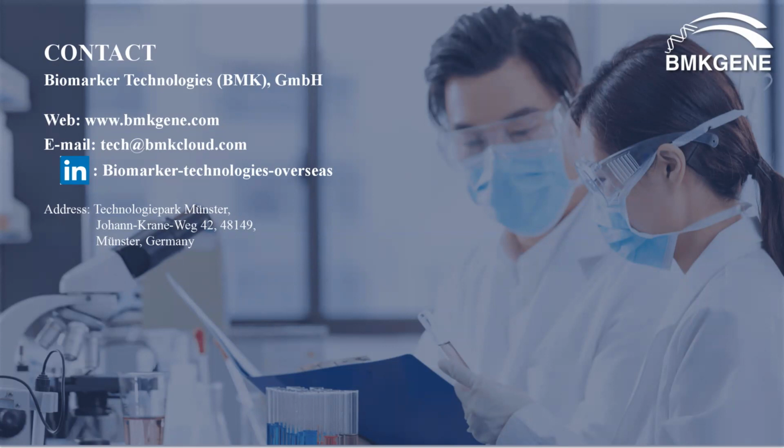Cool. Okay, it looks and sounds really exciting, to be honest. It's really cool, and again, the only worry here is whether the permeabilization of human tissue is similar to zebrafish. Okay, so that's something that I have no idea about. Yeah, it sounds very exciting. It's definitely worth trying, I would say. Cool. Okay, thank you. Okay, no worries.